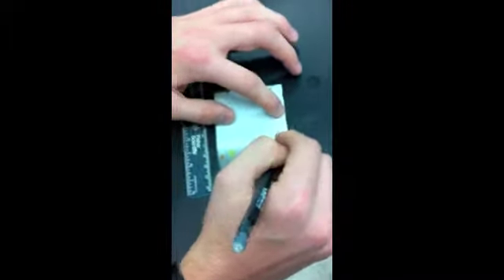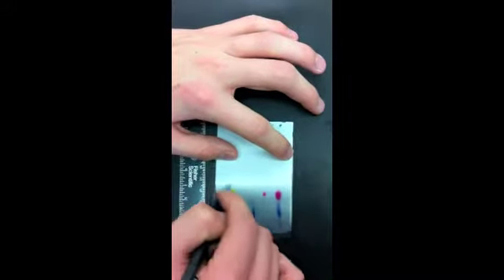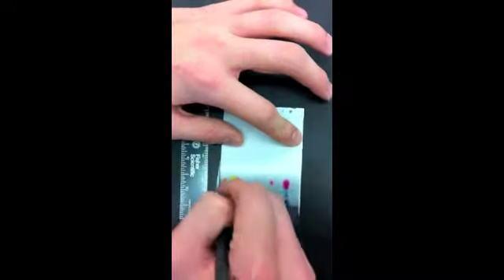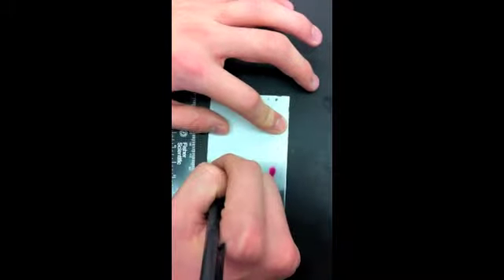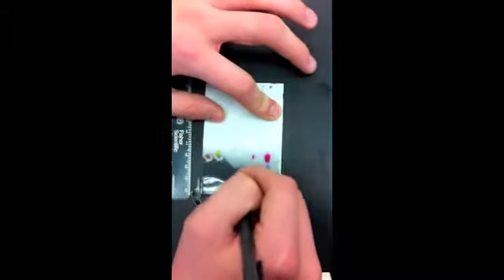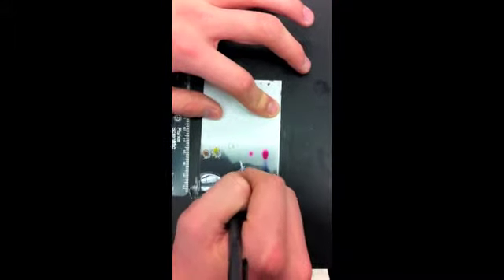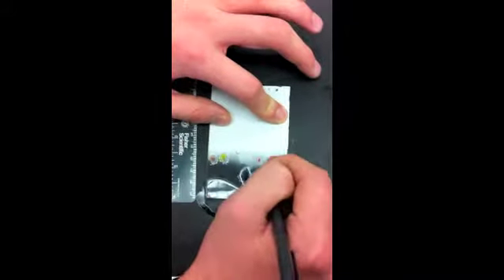Now that our 10 to 15 minutes have elapsed, I'm going to mark the solvent line and circle my solutions. That way, in case they fade or disintegrate, I'll know where they're at. Did I say disintegrate?